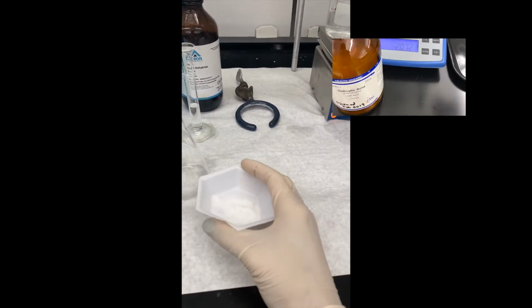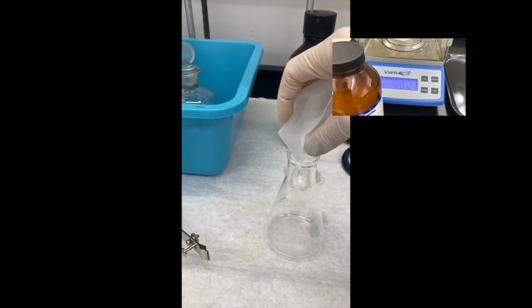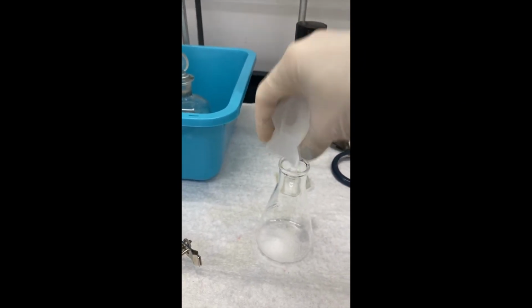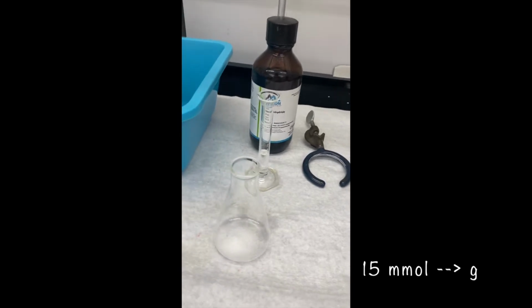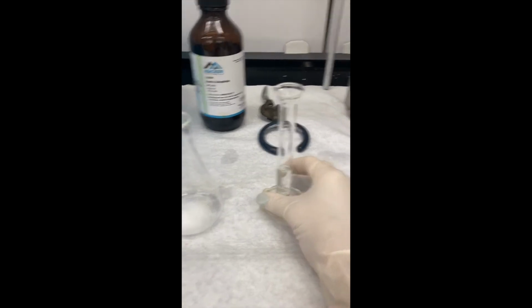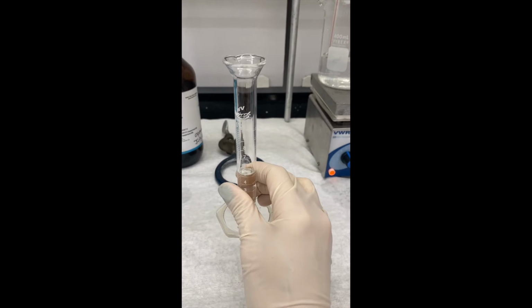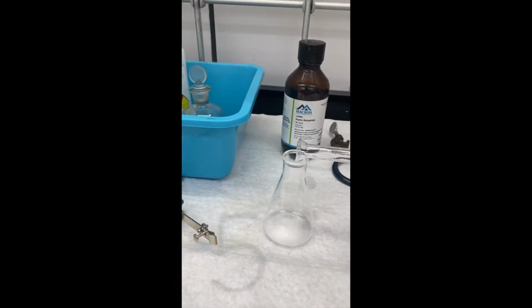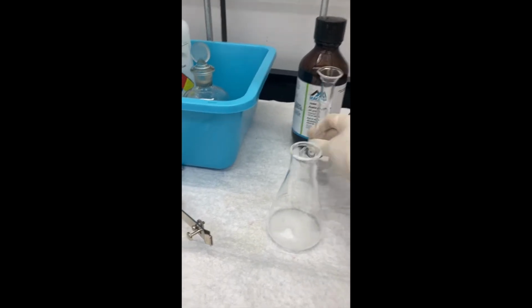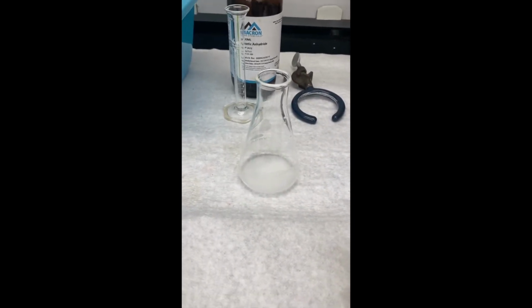So I've already weighed out the salicylic acid and posted the amount that was weighed out for you. That's 2.072 grams, but do show the calculation in going from millimoles. It's 15 millimoles to grams of salicylic acid. And then I'm just going to simply add my acetic anhydride, about 5 milliliters here, to my Erlenmeyer flask. Okay. And I'm just going to give this a little swirl.